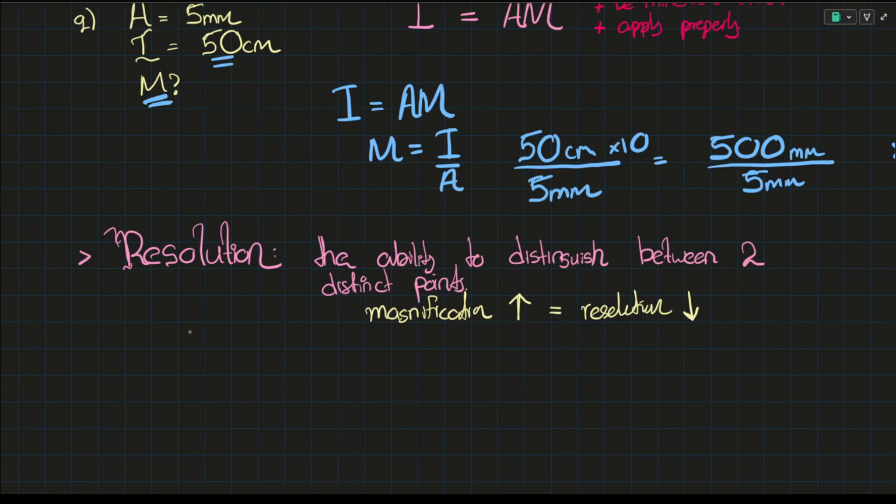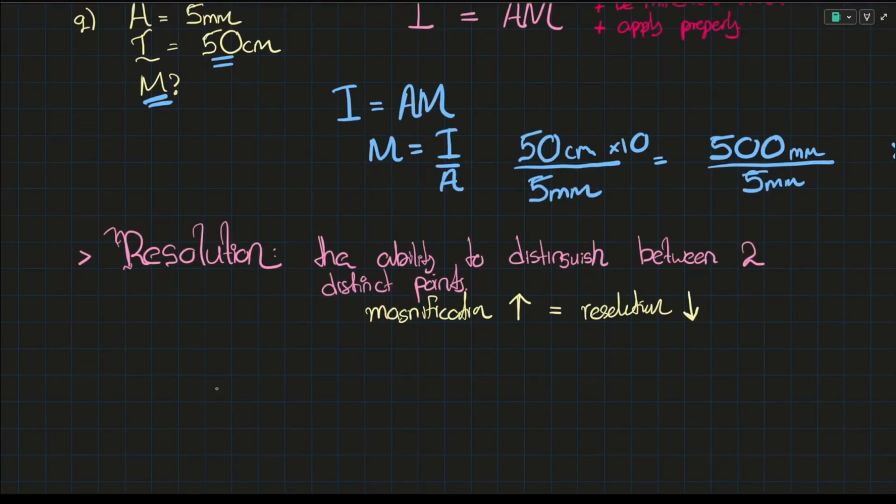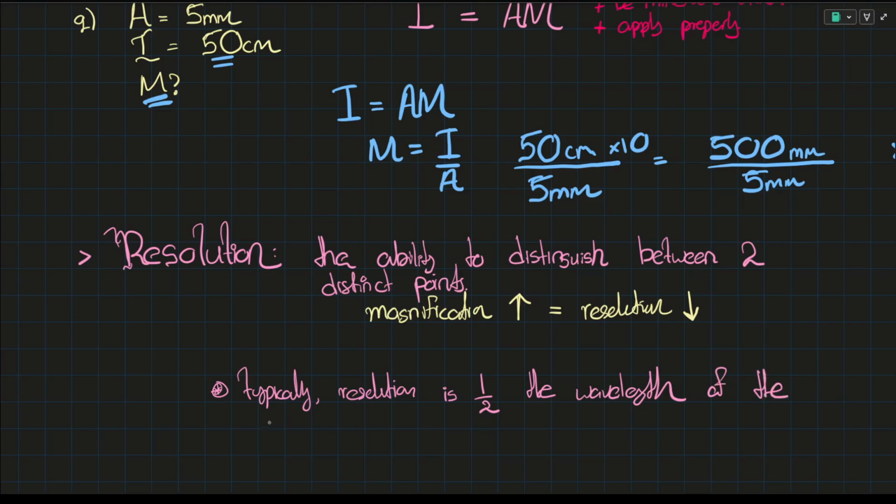Resolution is going down. Now that half business, do you remember I told you this half? So let's talk about that here. Now the deal with that is simply, typically, resolution is half the wavelength of whatever radiation we are using. One half the wavelength of the radiation used.